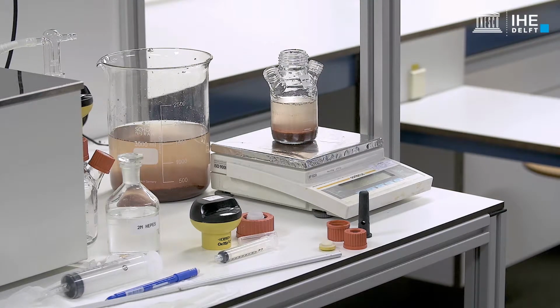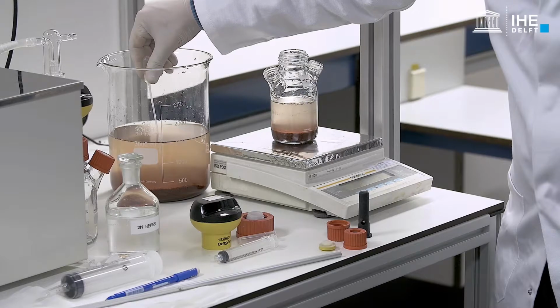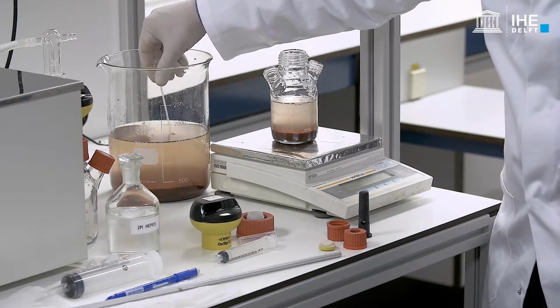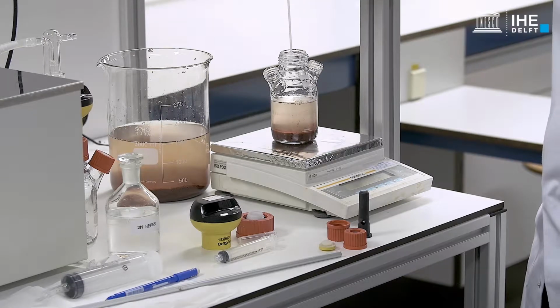The headspace volume should be sufficient in order to avoid the creation of an overpressure higher than the maximum that can be recorded by the manometric device, due to the consumption of the substrates dosed for the conduction of the batch test. See section 2.4.9 for further recommendations.